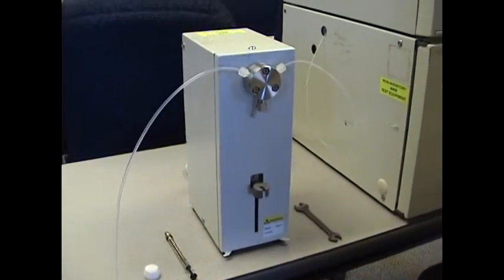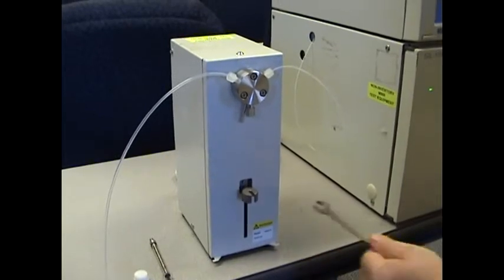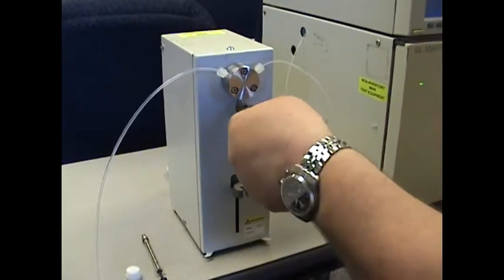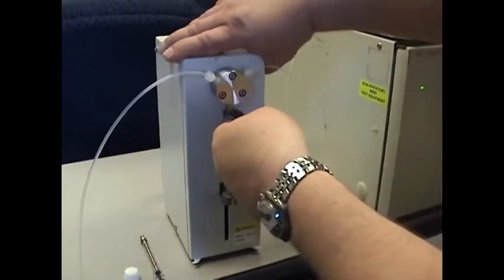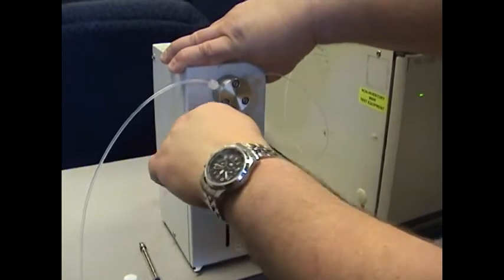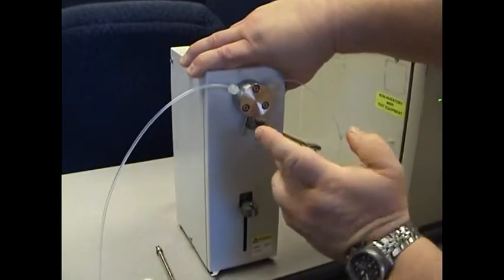Sometimes you can have issues with the nut right below the valve. Make sure that that is tight. You can use a metric wrench to tighten that up. You do not need to completely crank on it, but it does need to be firm. If you do have leaking, tighten it. If it's not, you can leave it be.